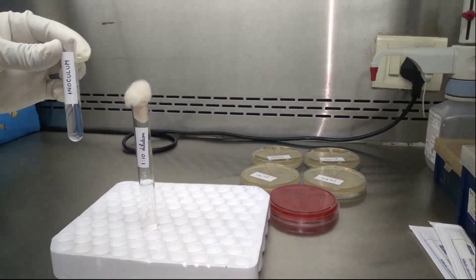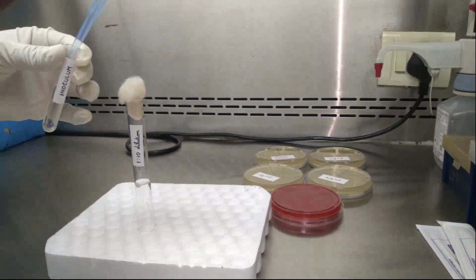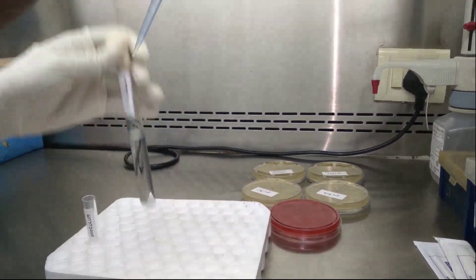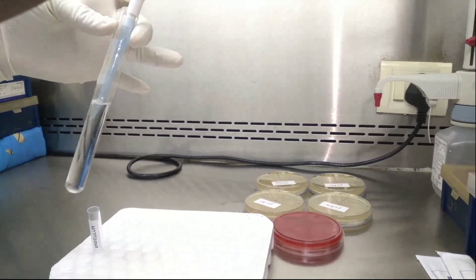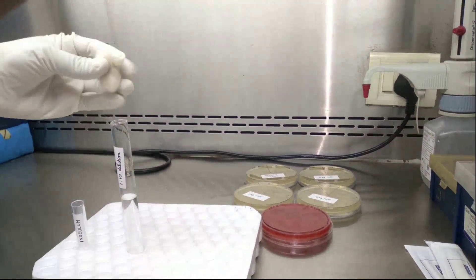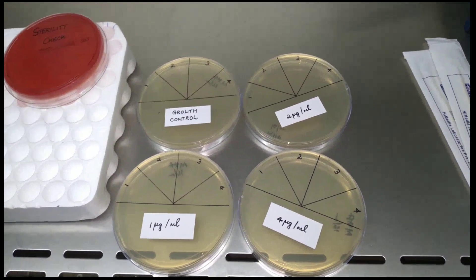Now let us prepare the dilutions. Take an inoculum prepared from 3 to 4 subcultured pure colonies, and prepare a 1 in 10 dilution from the inoculum. If you are testing 1 isolate you will have 1 inoculum; up to 10 isolates can be tested using the colistin agar plate. Prepare a separate inoculum and dilute it for each isolate, and divide the plates according to the number of isolates.